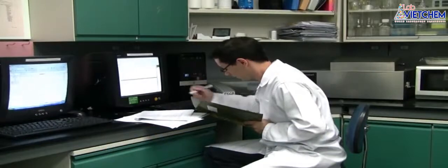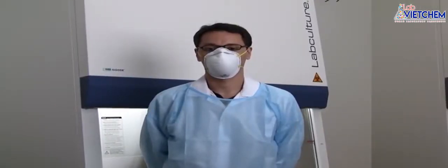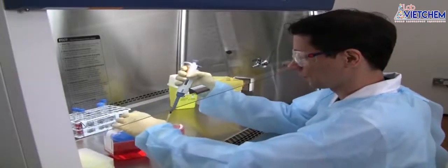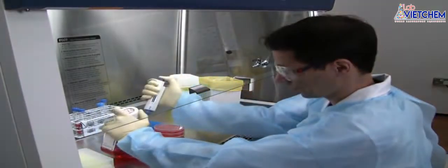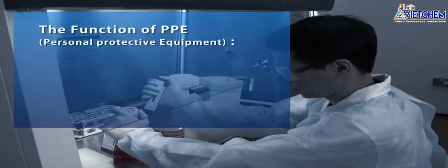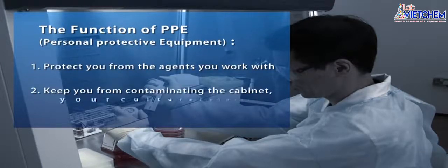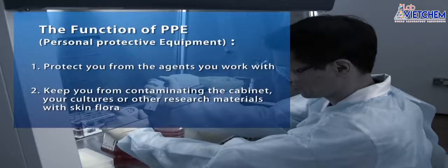The risk assessment you've made earlier may determine a respirator should be worn or eye protection should be worn, as cultures may be transferred to and from the BSC. Gloves, garments, and other protective equipment will protect you from the agents you work with and will also keep you from contaminating the cabinet work zone, your cultures, and other research materials with skin flora.